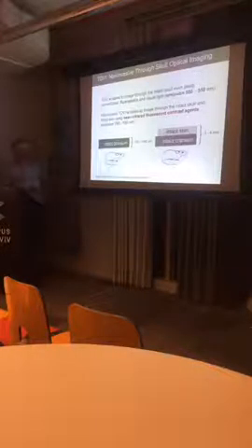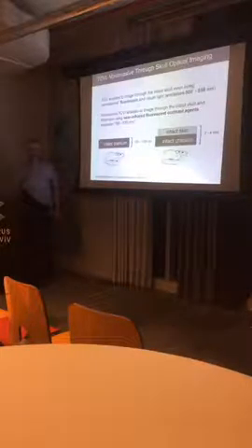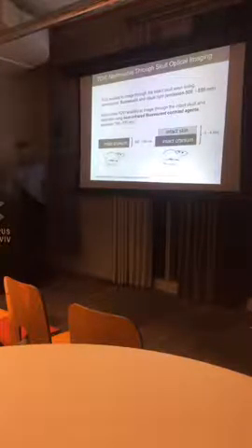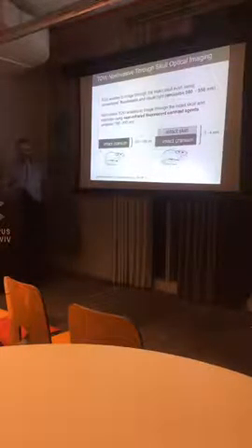Can you combine several cameras to give a complete image from all sides of the brain? Absolutely. We are specifically working on it right now. We've got the results already, pending and also submitted for publication.